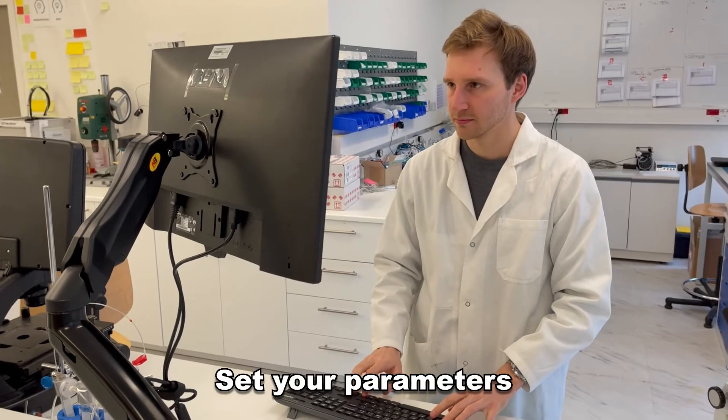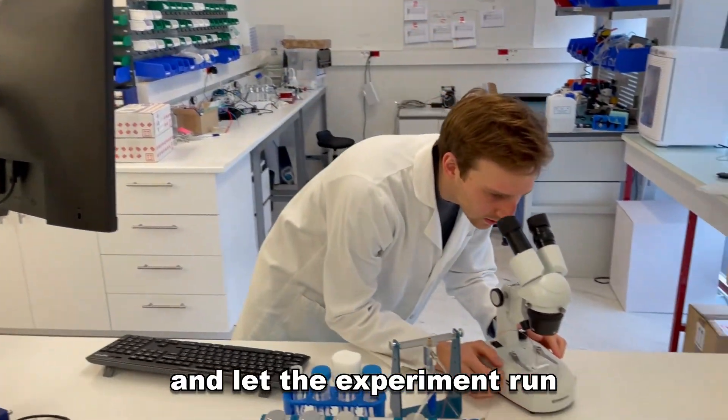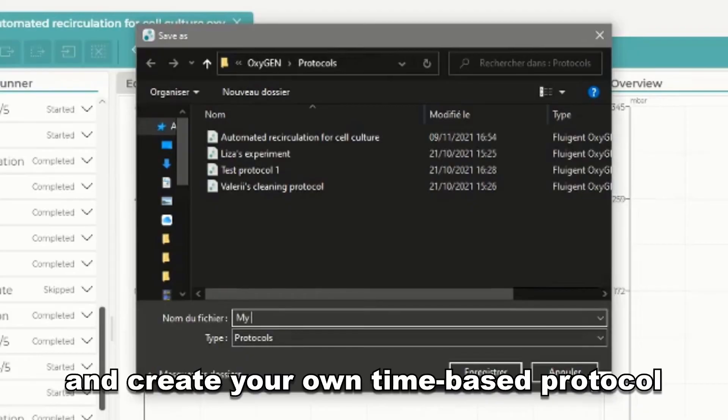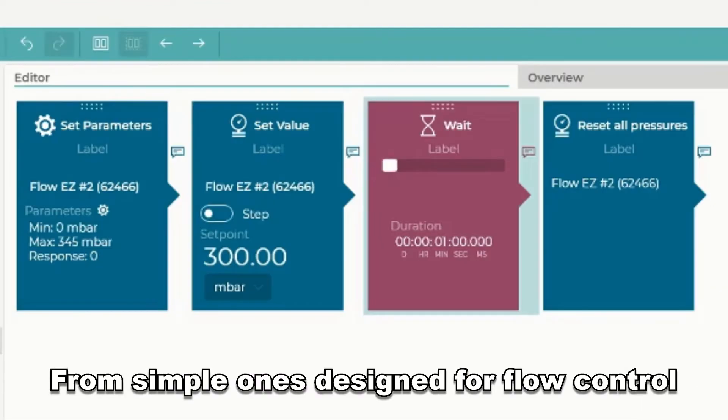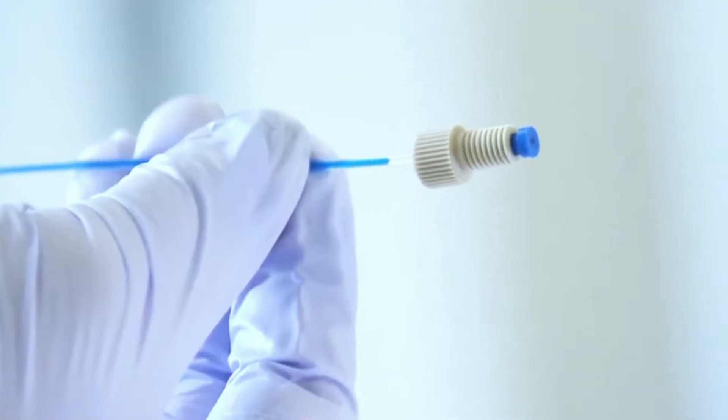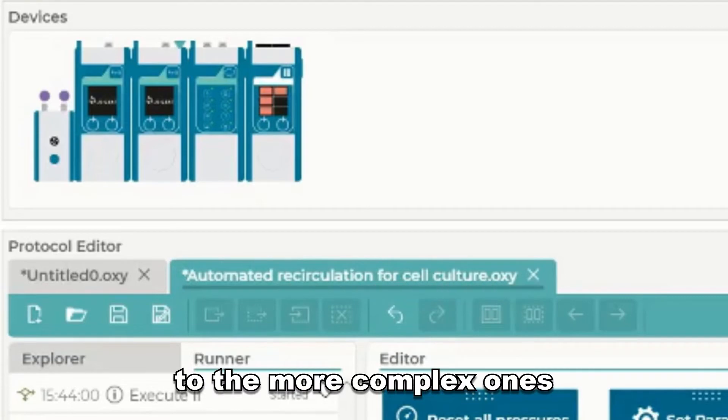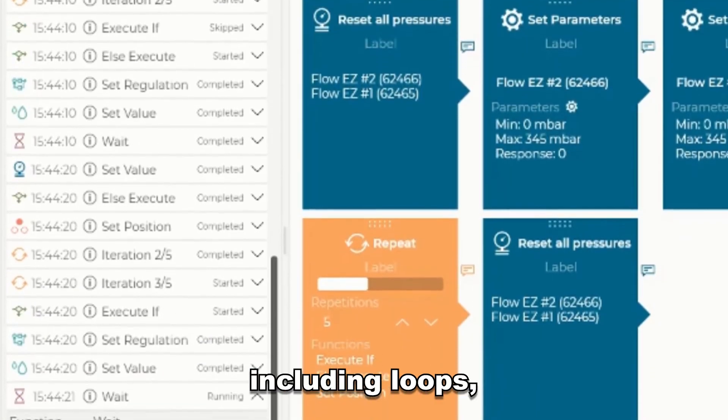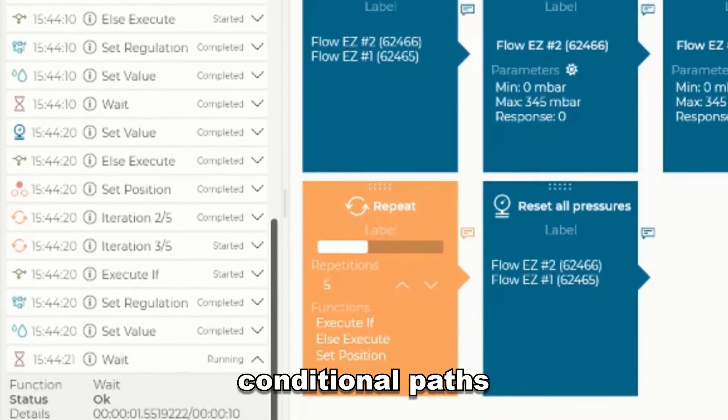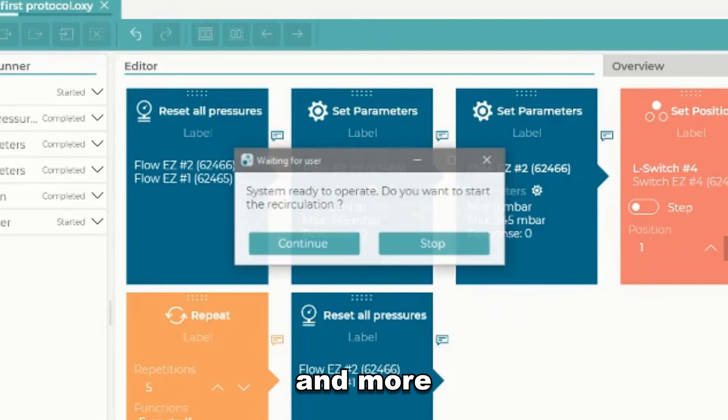Set your parameters and let the experiment run and create your own time-based protocol. From simple ones designed for flow control to the more complex ones, including loops, conditional paths, and more.